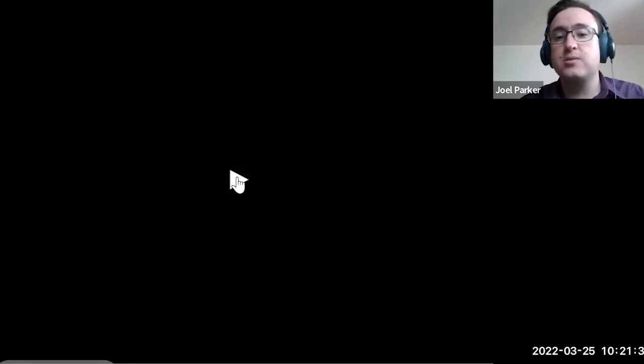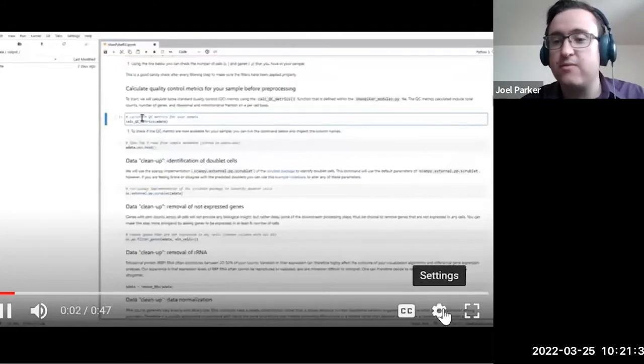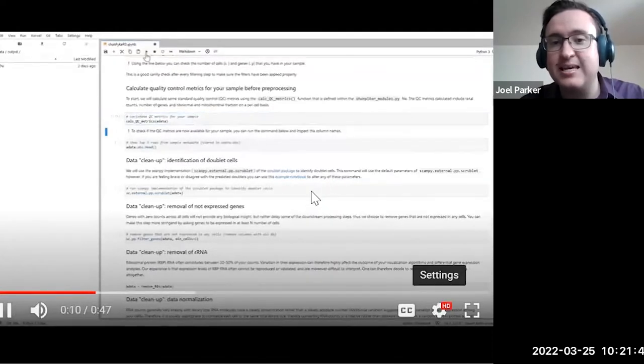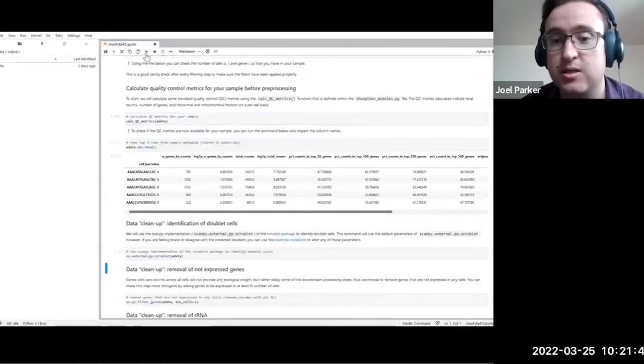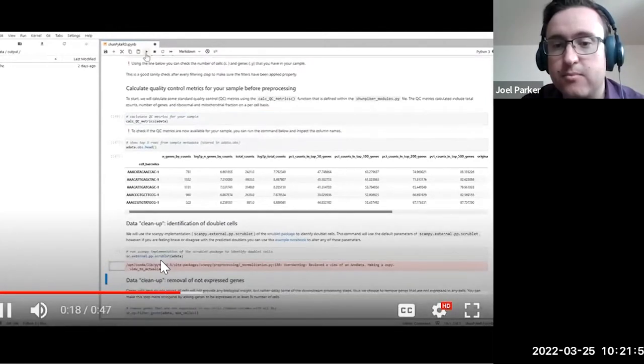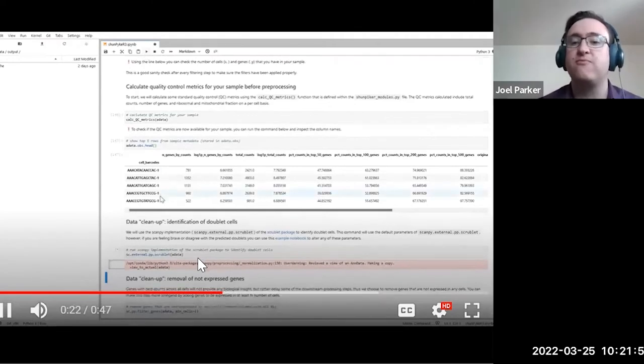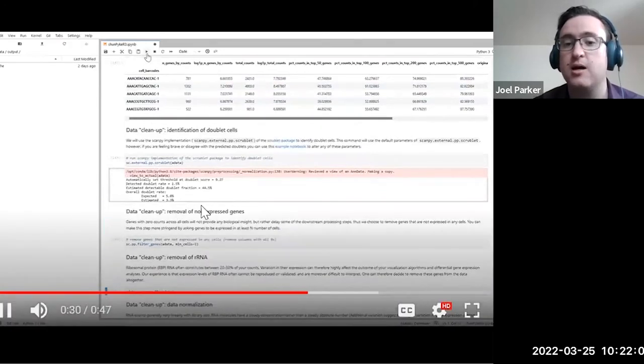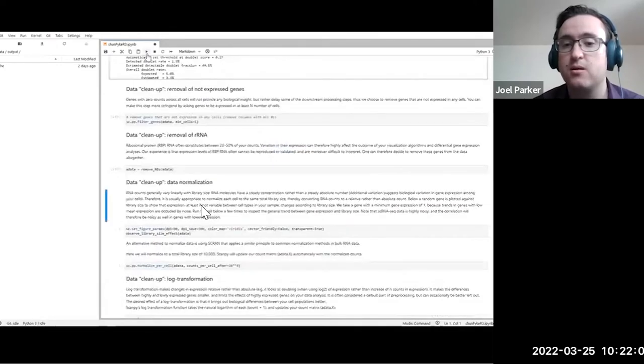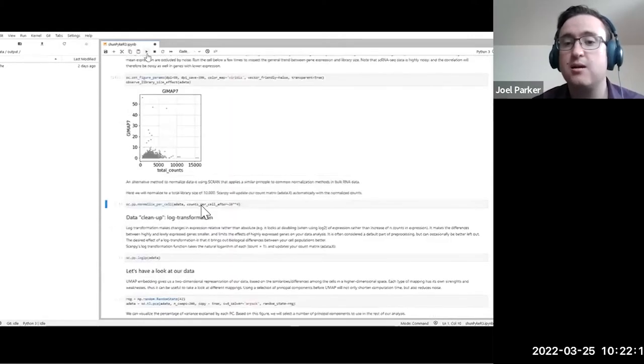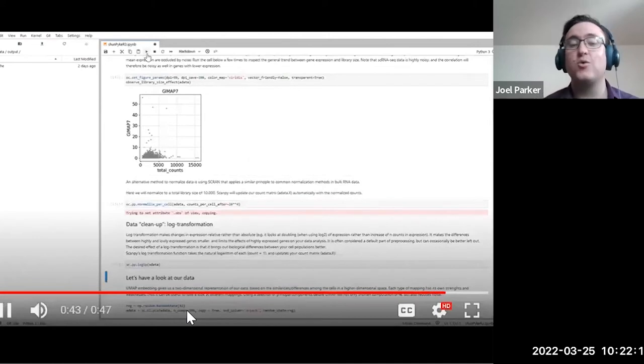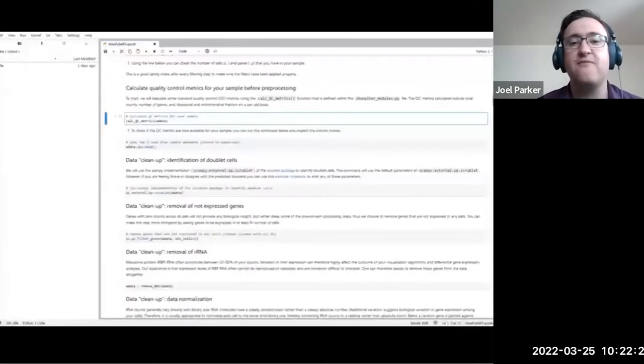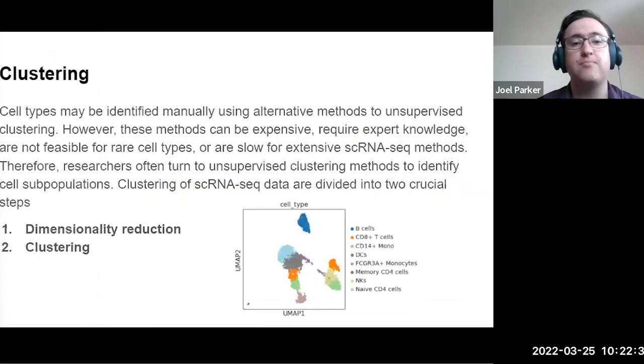So here's a demonstration of the importance of normalization. In our Shunpiker app, it comes with a preloaded example of 2700 PBMC cells. So currently we're running Scrublet here. You can see we expected to see 5%, we only saw 3.3%. And then we filter and then we normalize here. So you can see in 47 seconds, we did all of those quality control steps and we also did all of the normalization steps. And that's really to demonstrate how easy and how fast it is to do quality control and normalization in the Shunpiker app.